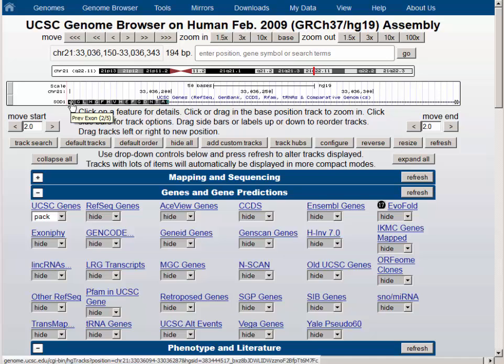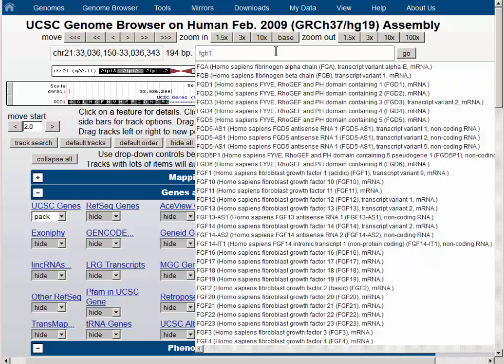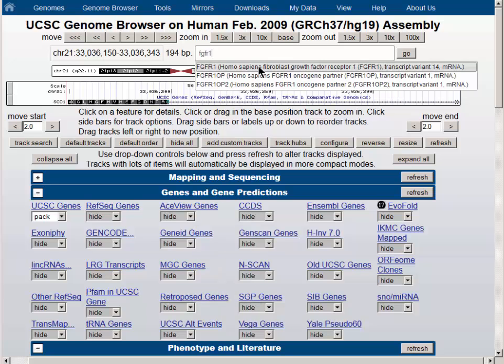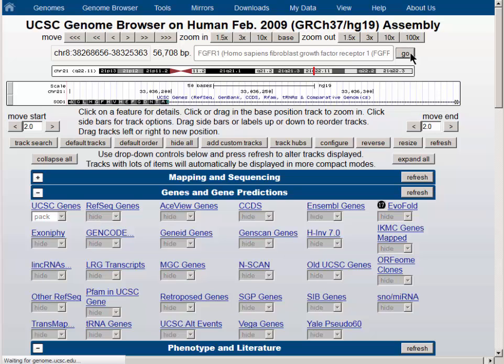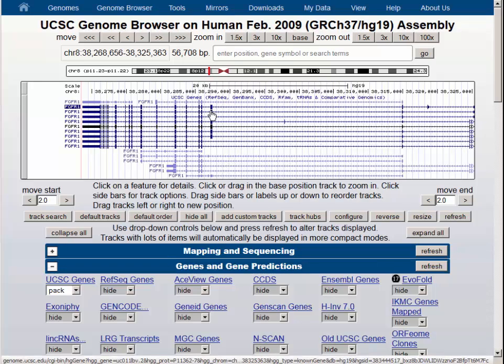If you're between exons in the middle of an intron, it will tell you the number of the next exon over. So let's pick another gene that's a little more complicated — the FGFR1 gene — and choose the gene from the menu and hit the Go button. It puts the gene in the middle of the screen, and you can see that there are multiple isoforms, some of which contain this large exon and some of which do not.